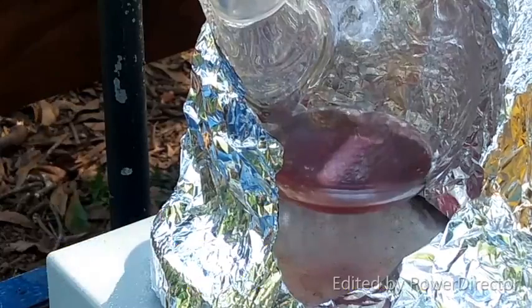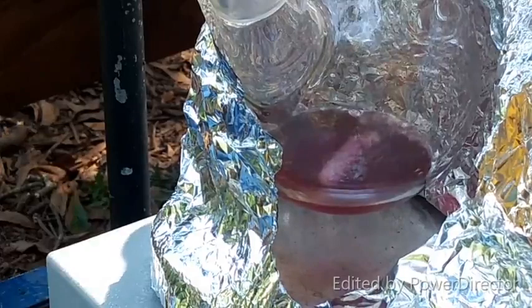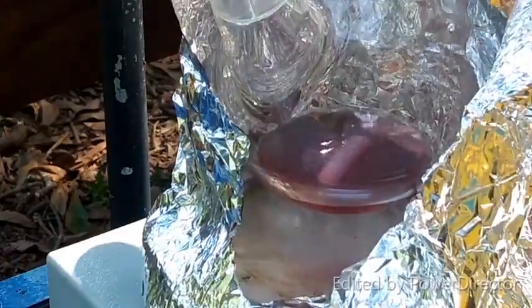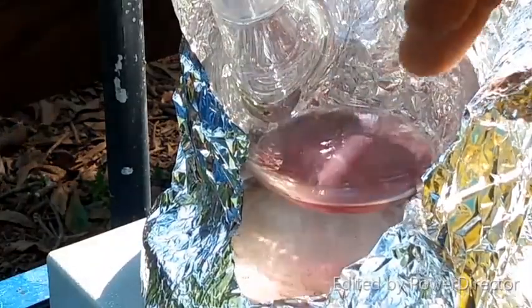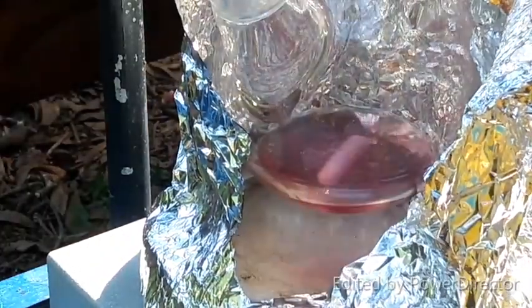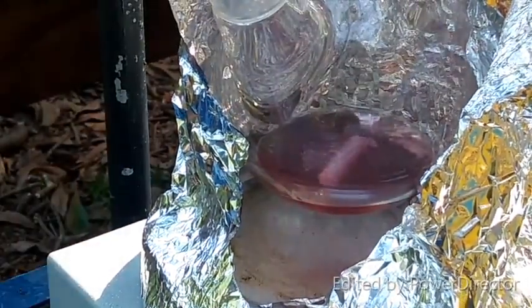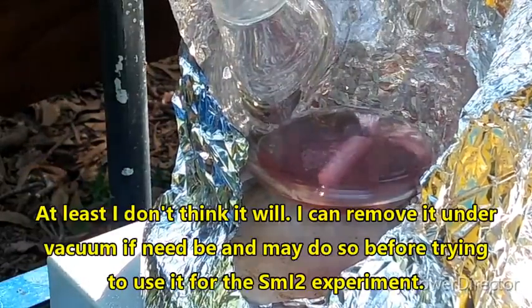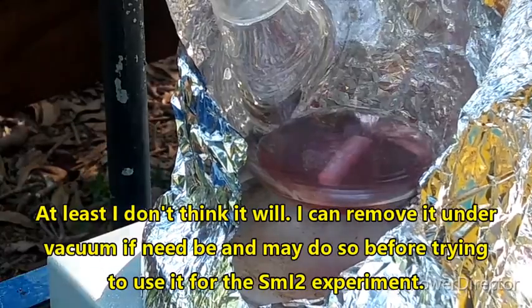I would demonstrate it actually freezing because it freezes between 5 and 6 degrees C, but I had to use a little bit of just straight starter fluid to rinse the solution off of the magnesium sulfate. So there's going to be a little bit of heptane in here. That is unfortunately unavoidable, but again, heptane is not going to really cause a problem for making samarium diiodide. It is already as reduced as it can possibly get and should be pretty inert. So I don't think that's going to cause a problem.